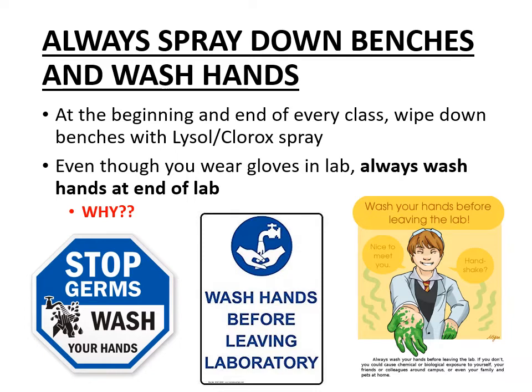Also, always make sure to wash your hands at the end of every lab, even though you were wearing gloves, okay? Proper hand washing in settings like this is so important because hand washing at all is the most effective way to break the chain of infection. And you've seen that now that you've all lived through a pandemic and you've kind of gotten firsthand experience of why hand washing is so valuable.